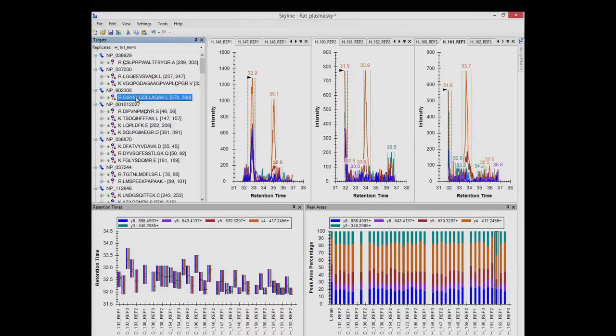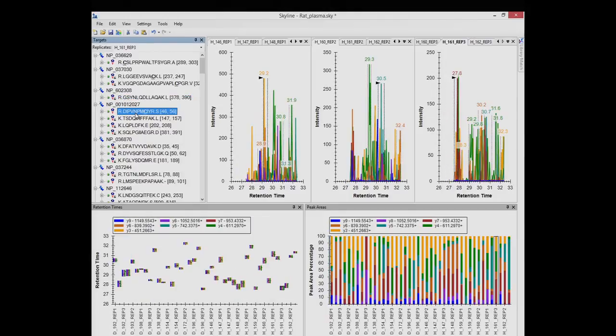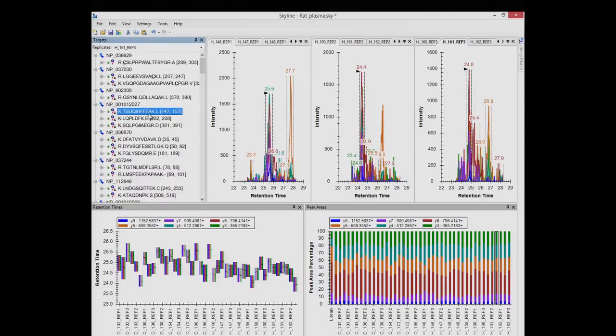And in a lot of cases with good data, this is pretty extreme data where we have a lot of problems. This next one's not even worth correcting. It's just too far gone, and if Skyline can't pick, you can see it's very low abundance. We're seeing nothing higher than like 400 or 500. So this would delete.